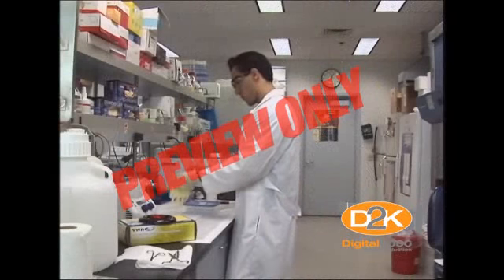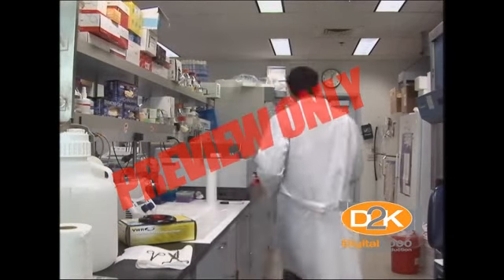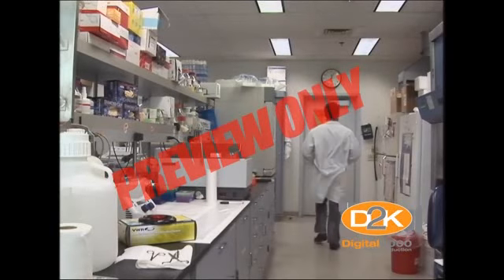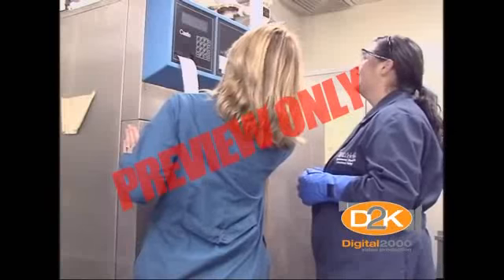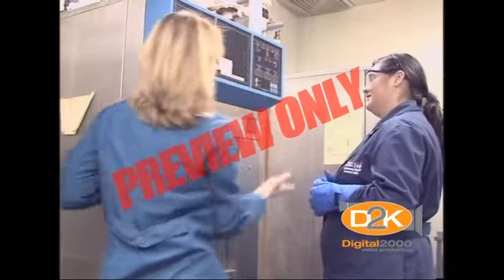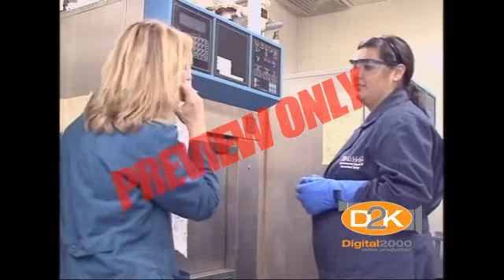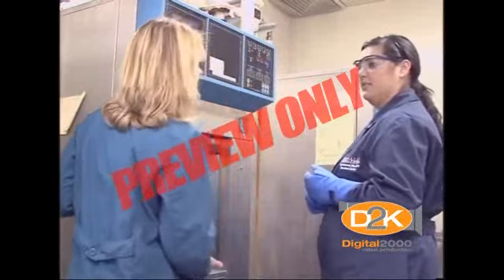Personal protective equipment must be removed before leaving the laboratory, unless it is being used to safely transport substances between rooms and buildings. Even though personal protective equipment is an important component of a comprehensive laboratory safety program, it is not a replacement for good laboratory practices, engineering controls, and safety equipment.